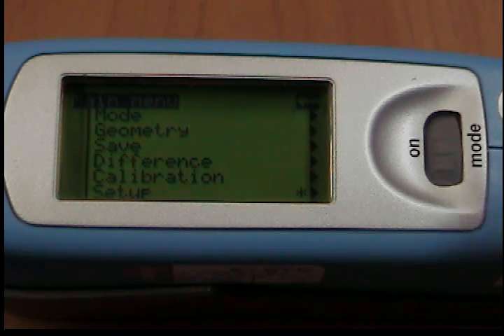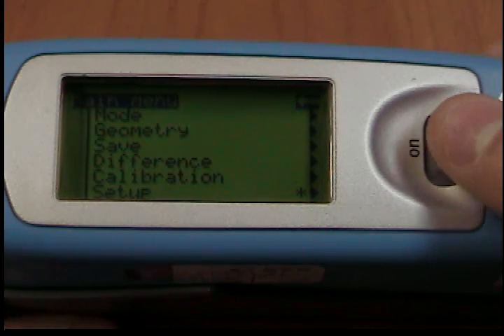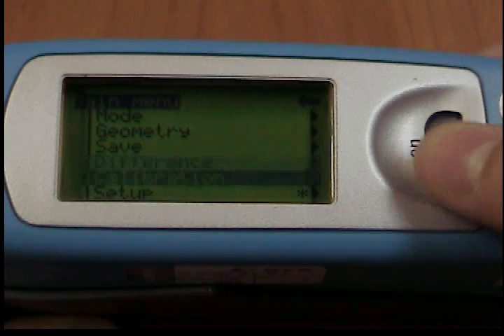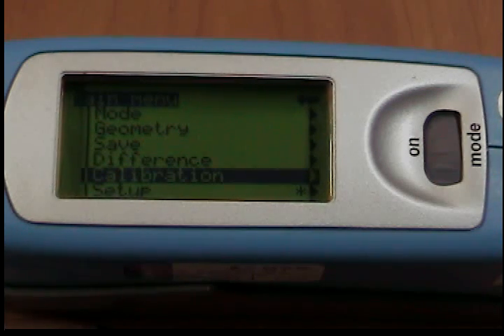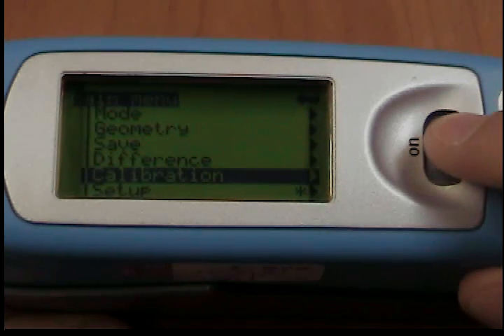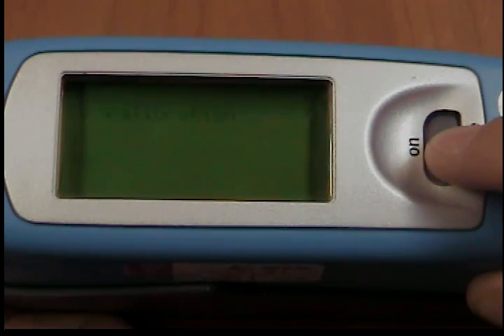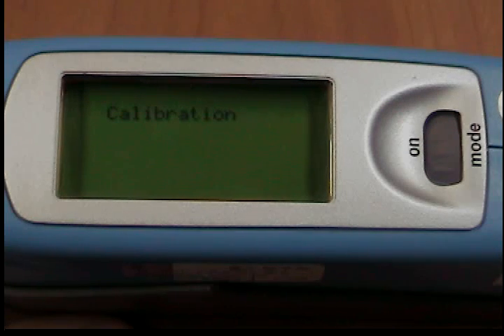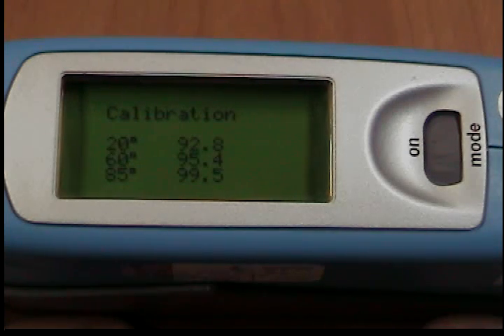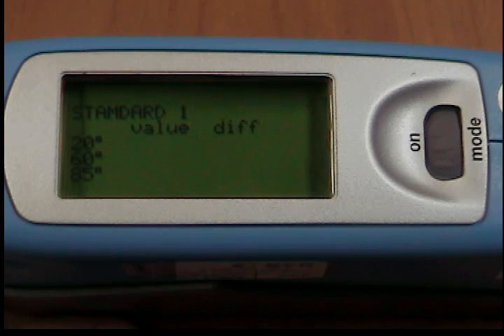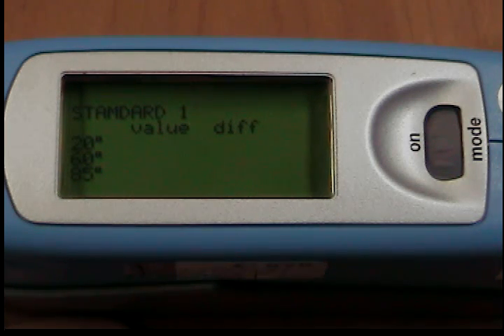You can use the path shown on the left side to reach the Calibrate menu option. To begin calibration, press the wheel. The calibration process is performed automatically for all three geometries. The saved calibration values of the standard appear in the display. The unit then switches into measurement mode.